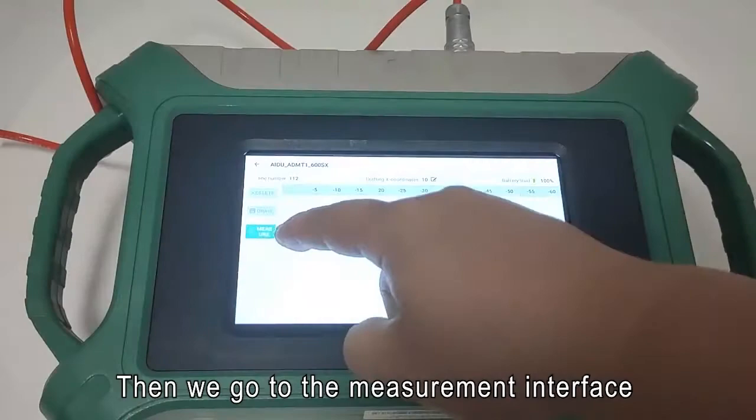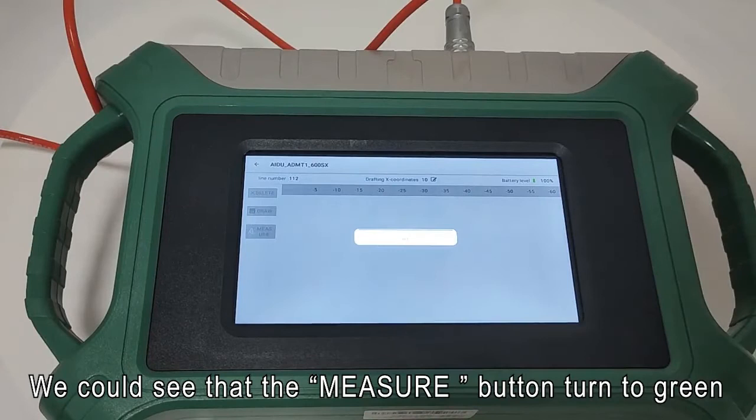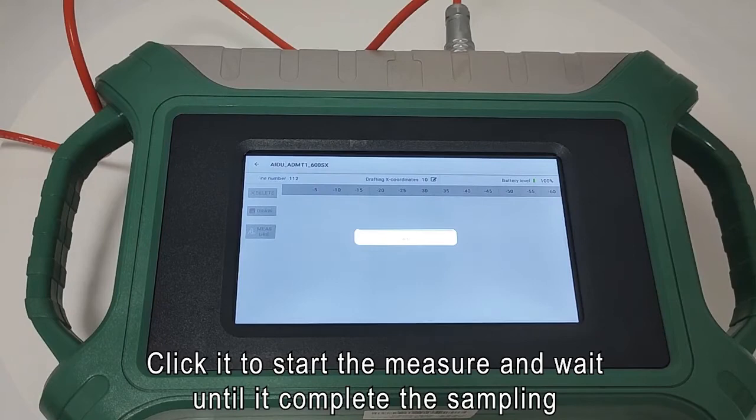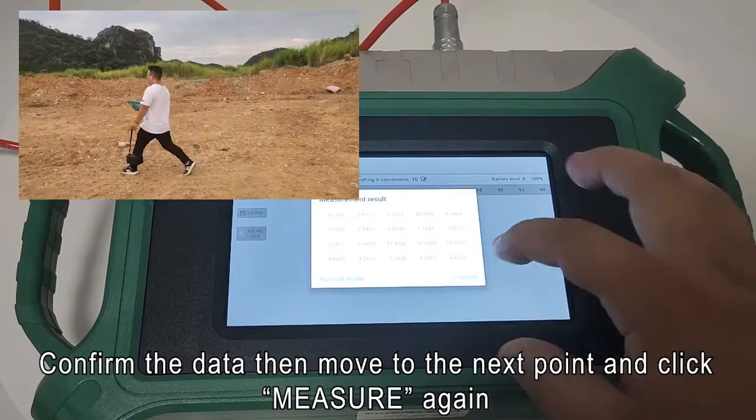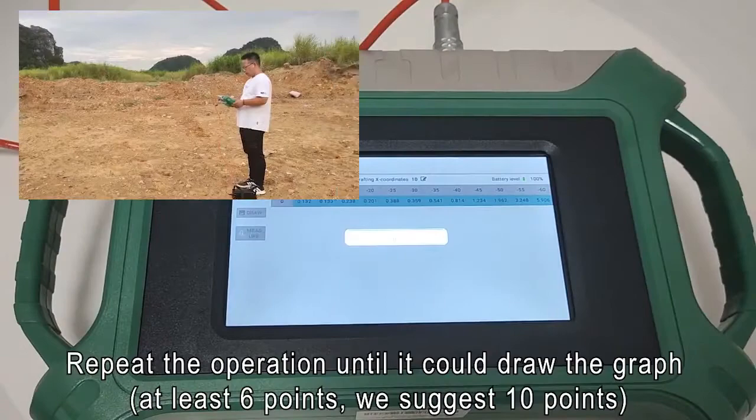Then we go to measurement interface. We could see that the measure button turned to green. Click it to start measure and wait until it completes the sampling work. Confirm the data then move to the next point and click measure again.